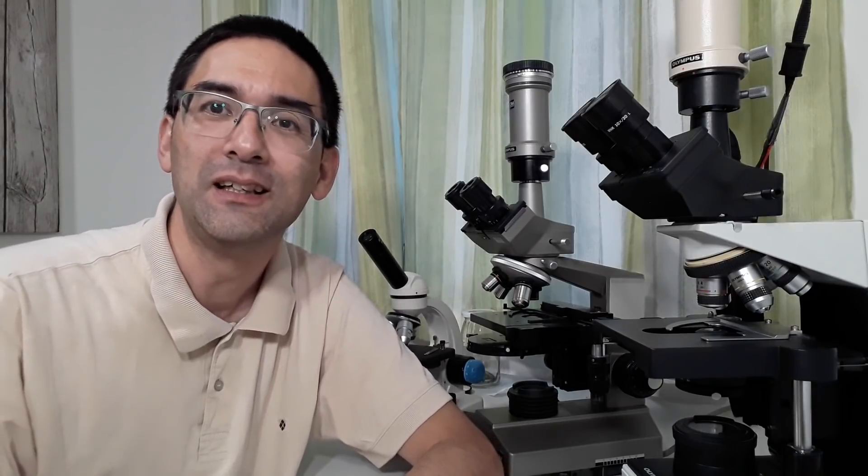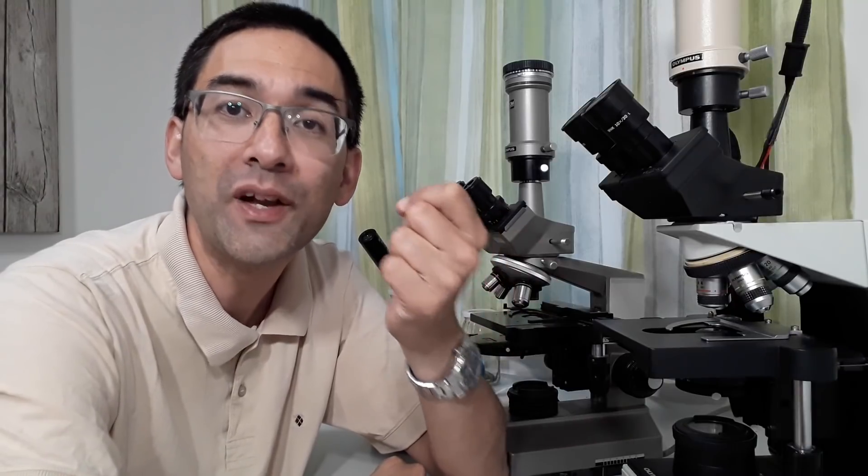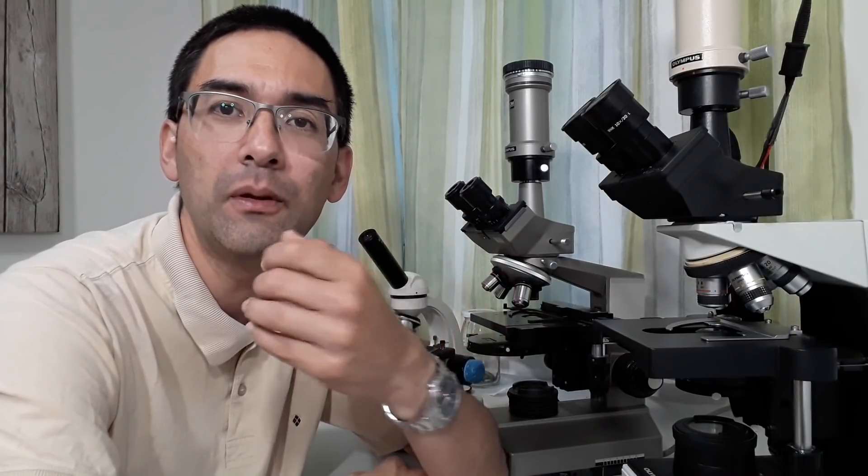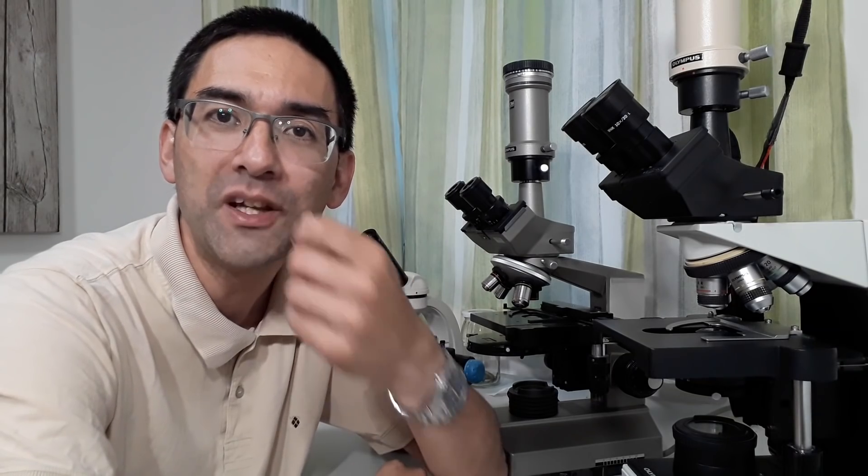And now I still know this is does not answer your question because you want to know, should you get yourself a phase or DIC microscope? And for those of you who do not know the difference, these are kind of specialized microscopes, which allow you to see very fine structures which are transparent. So they basically allow you to see a transparent structures much better. And the answer is the following. If you go to a company and ask for a phase contrast or DIC, then most likely the answer will be already be given to you simply when they tell you the cost of these devices.